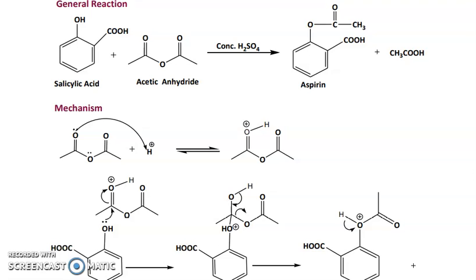Today in this video, I am going to talk on synthesis of aspirin. This experiment is very common for BSc students. So in this video, we will learn first about the reactions of aspirin, then we will learn about the mechanism of this reaction.